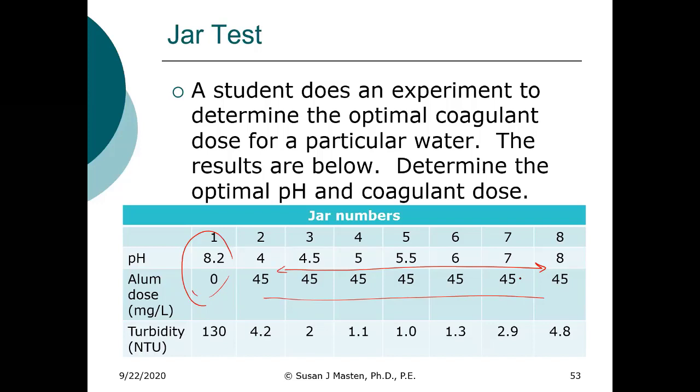So what one would do would be measure the turbidity. So this is the turbidity of the control, so with no treatment, but having gone through the entire process. And then you can see here the turbidity of the samples. We may also, in some cases, do UV 254, which essentially gives us an indication of the amount of aromatic hydrocarbons that are present in the water, and it's related to the naturally occurring organic matter.